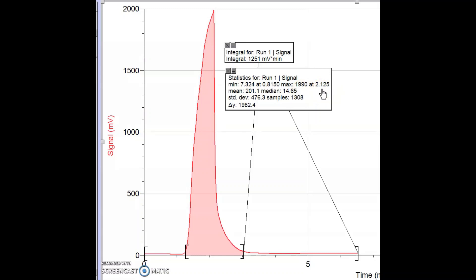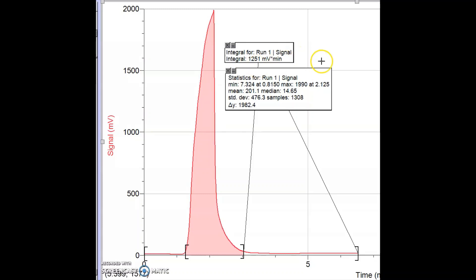Another thing I can do with a graph like this is look at the area underneath the curve, between the curve and the x-axis. That is called the integral. You'll learn how to do that by hand in calculus, but LoggerPro can do that for us. I highlighted this area and found that the integral is 2.1251 millivolts times minutes — it is the area underneath the curve.